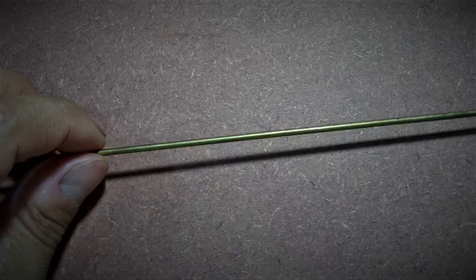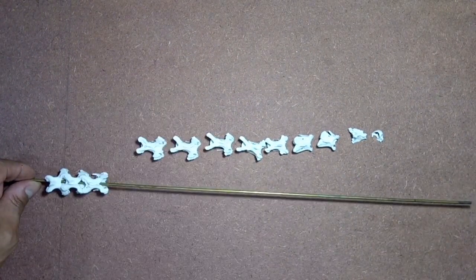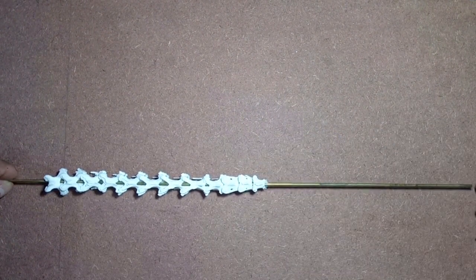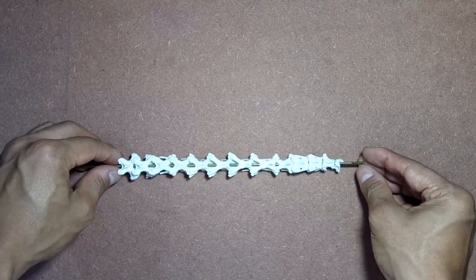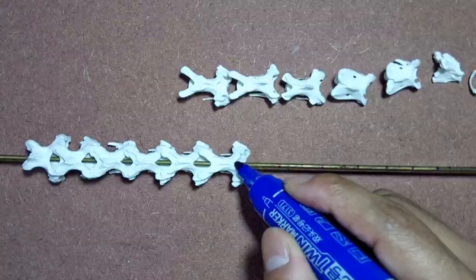Now that we know the order of arrangement of the bones in the vertebral column, we can proceed with articulating them. To articulate the vertebral column, we'll be using a rust-proof metal wire or rod to impart extra stability. The metal rod should be thin enough to snugly pass through the neural canal — the holes in the vertebrae that house the spinal cord — but thick enough to provide rigidity, as the limbs and ribcage will eventually be supported by the vertebral column. Take the metal rod and start inserting the cervical vertebrae in their order from one end of the rod, leaving about a centimeter of rod spare on one end for the skull. Then using a permanent marker pen, mark the points where each vertebra would eventually fit on the rod, and then remove the vertebrae.